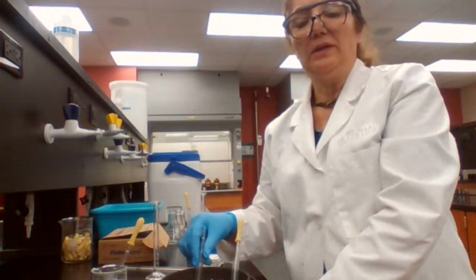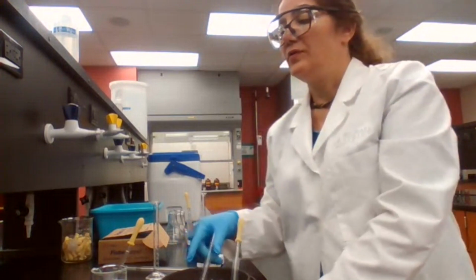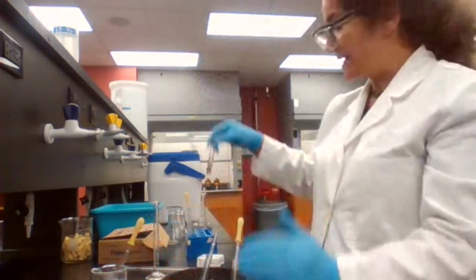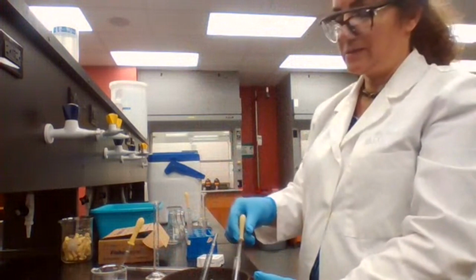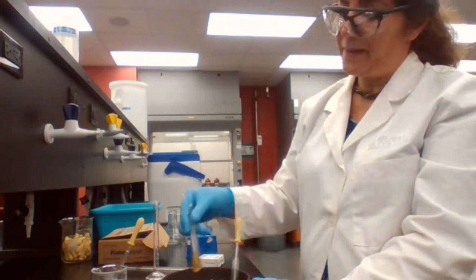We are still at step 3. For one of the reactions, I have it at step 4, one set. The other set is at step 3. Just adding one drop at a time.